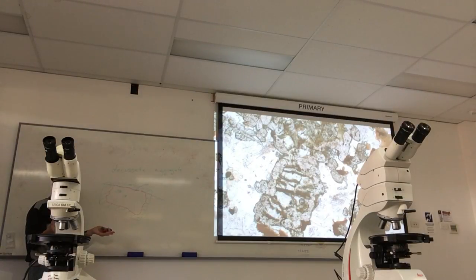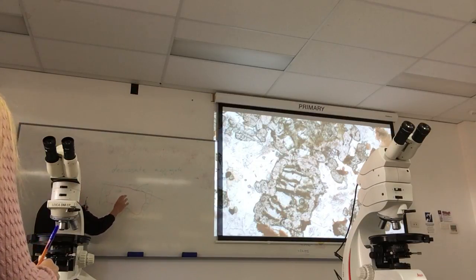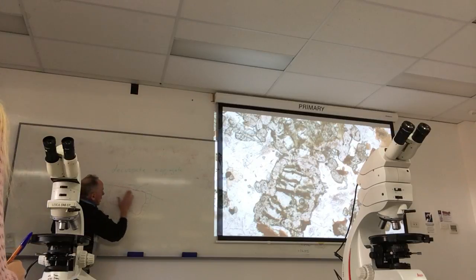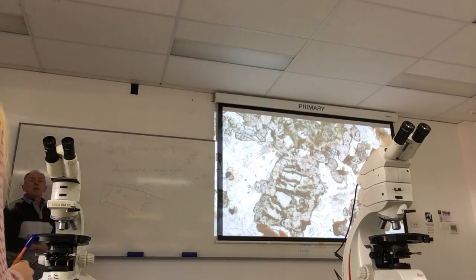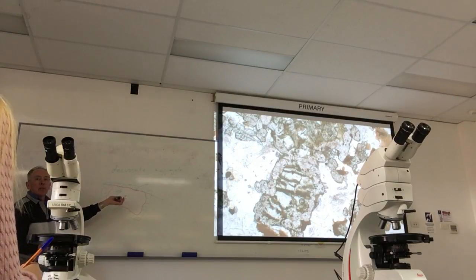If you think in the third dimension, they're just a little dish-shaped, and it might be coming up from the other way. They're just a little bit that's coating around the outside, and you just happen to have sectioned through the edge of a pyroxene grain, and it looks like there's hornblende inside the pyroxene.